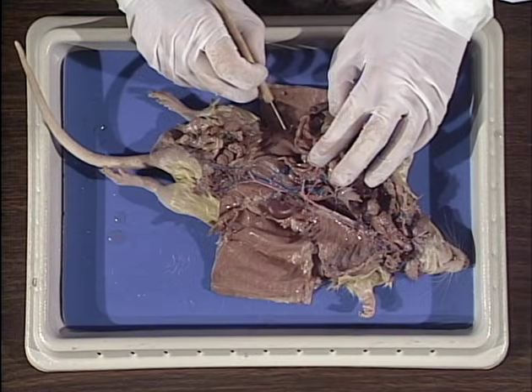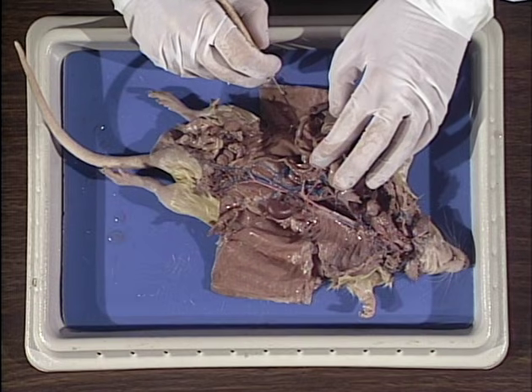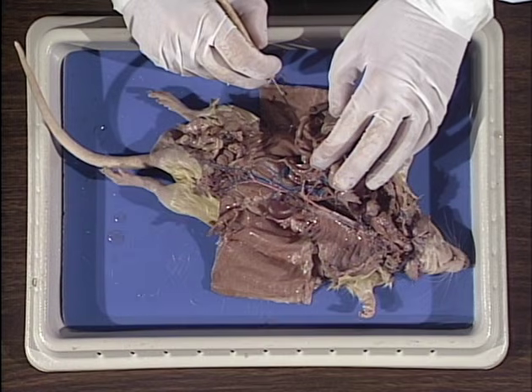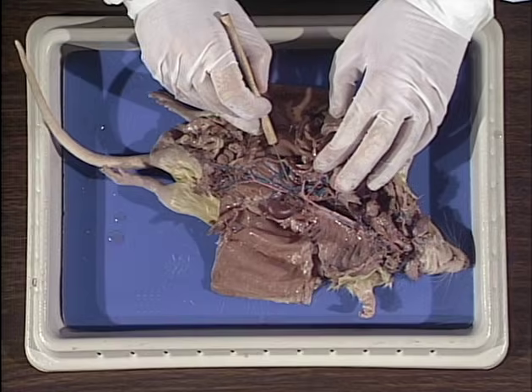Also seen in the rat are several veins. Veins are vessels that carry blood back to the heart. They have thinner walls than arteries. They also have valves which prevent the backward flow of blood. They are stained blue in the rat.